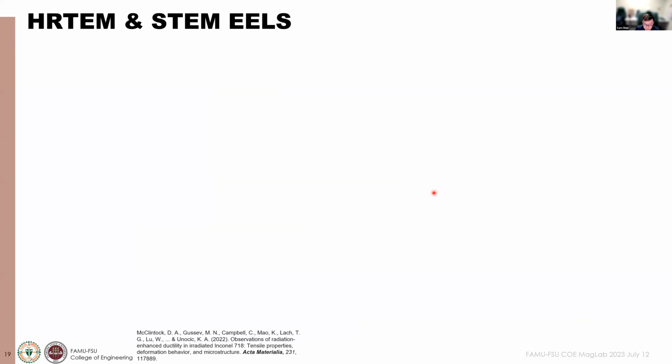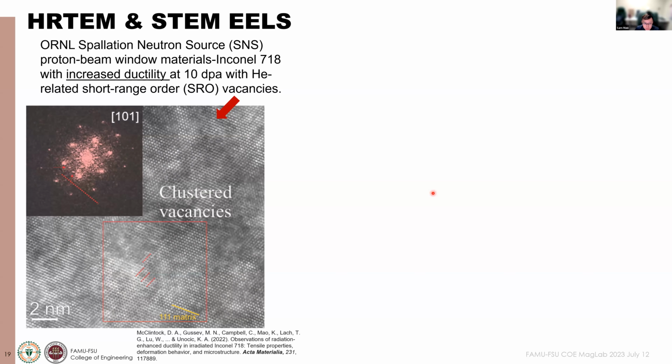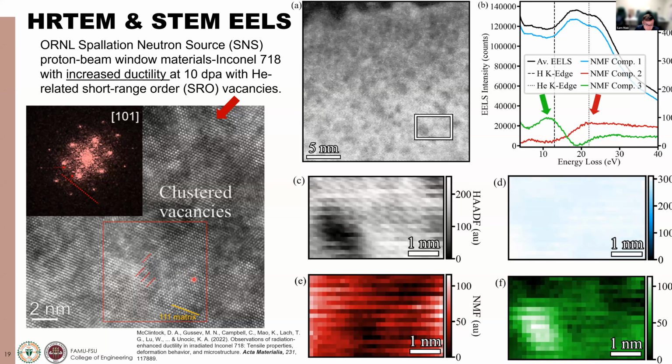This can also be used for high resolution TEM and EELS. You can do a simple image filtering method using PCA, for example for energy filtered TEM, to see some of the speckles. Some fellows at Berkeley do that for short range order in high entropy alloy systems.